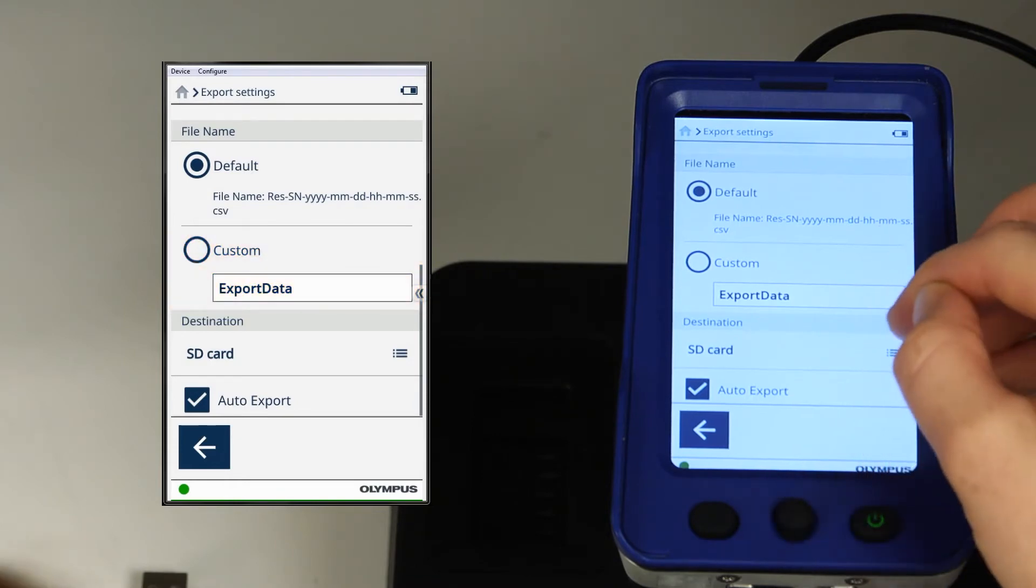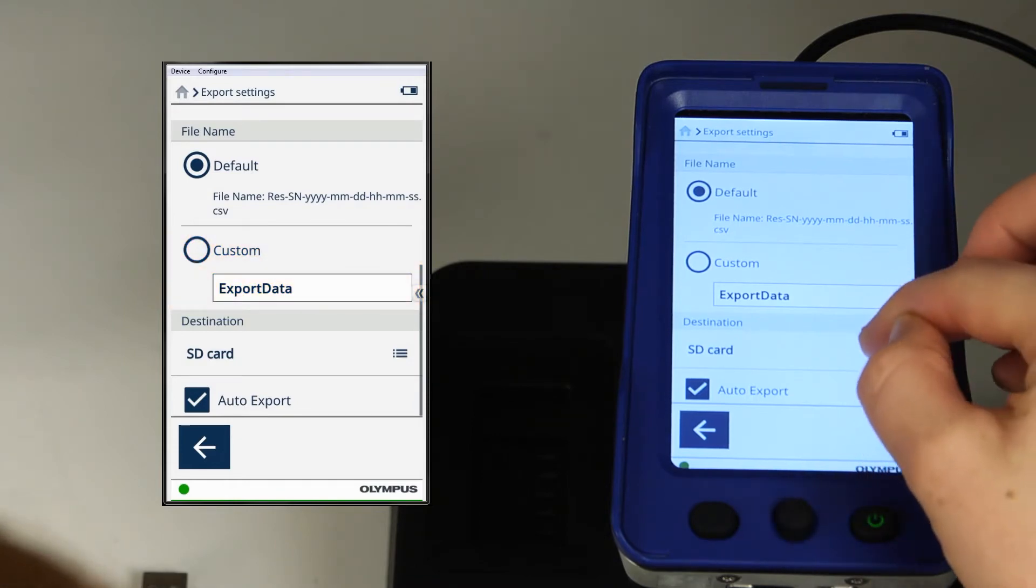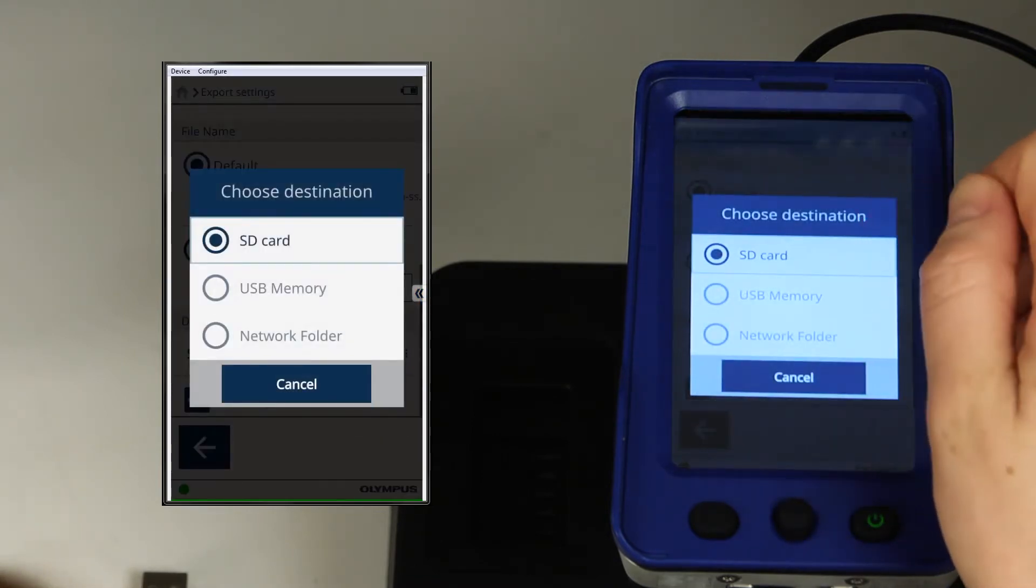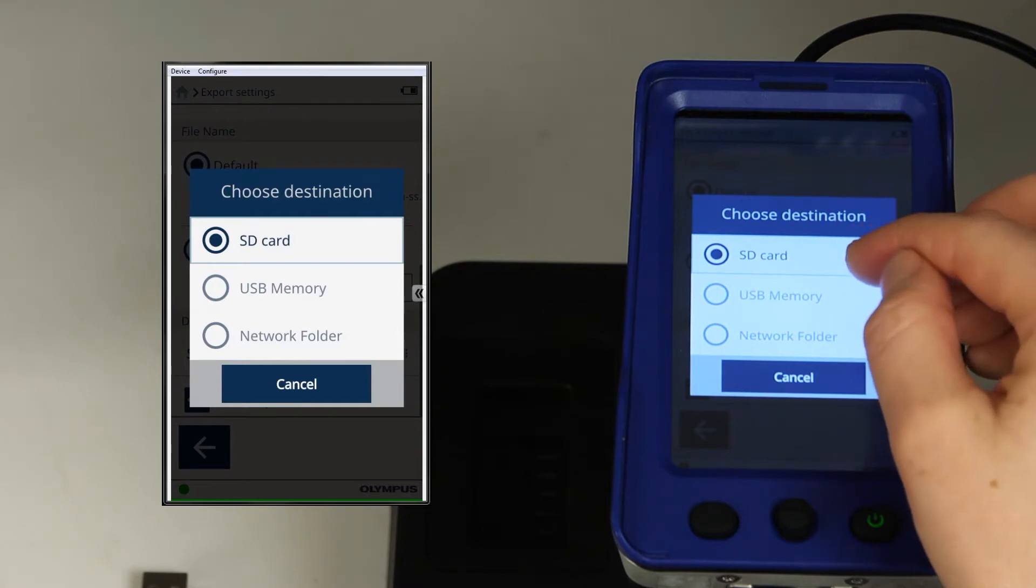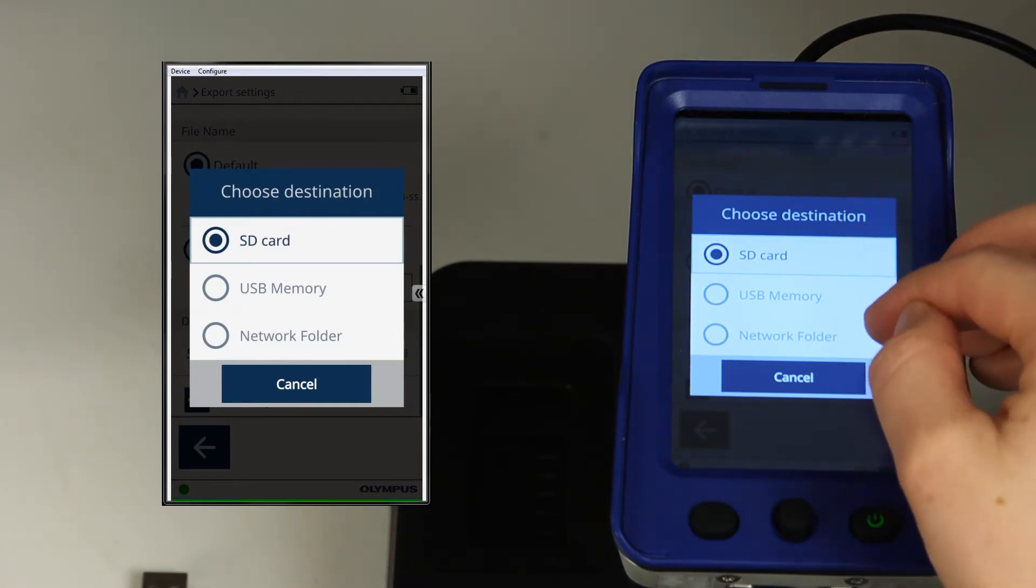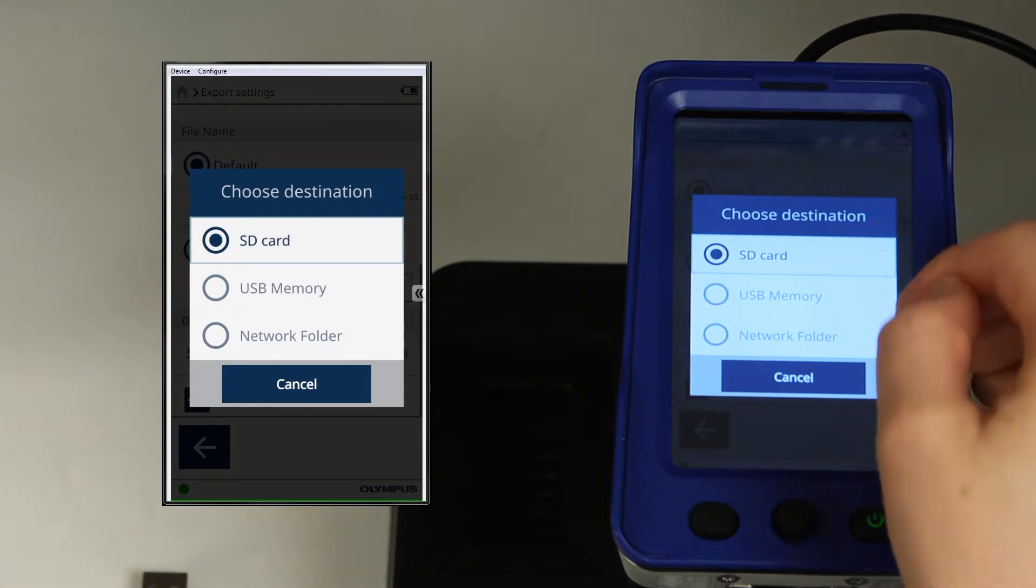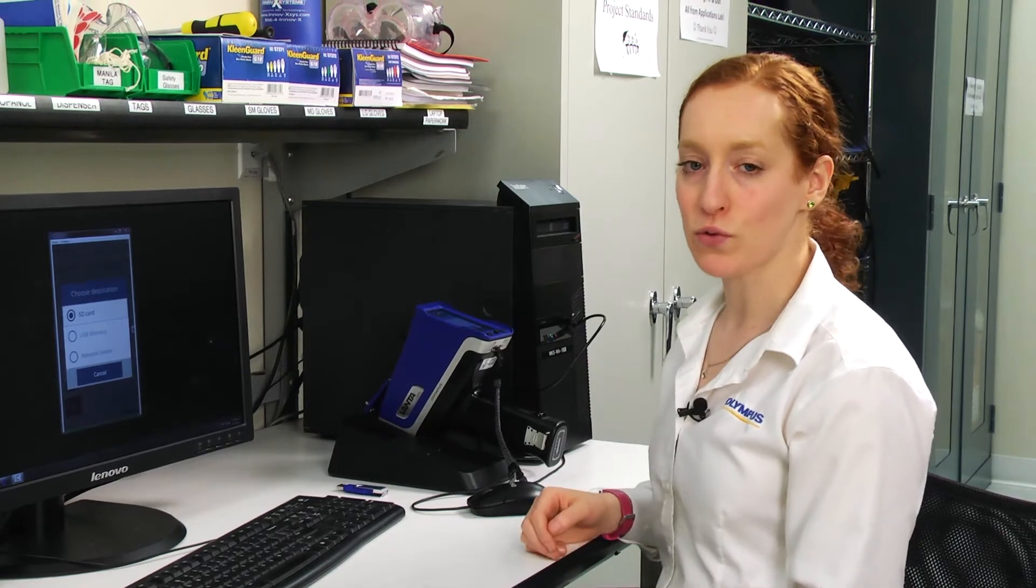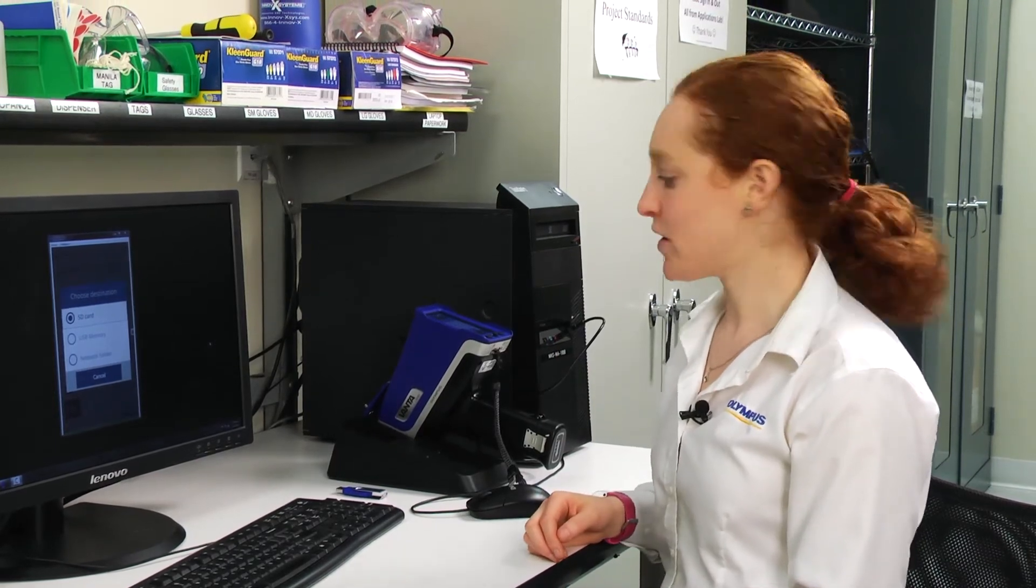For the destination, you have the option of SD card, USB memory, or network folder. We'll go over exporting to a network folder in another video.